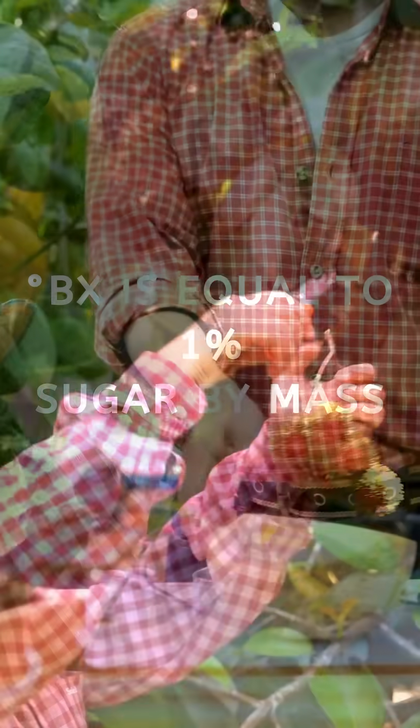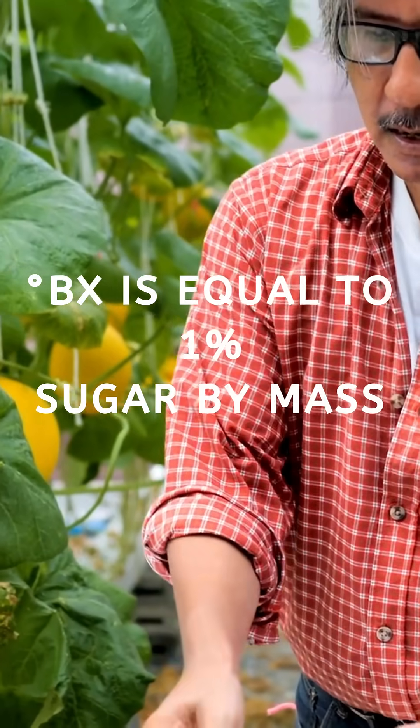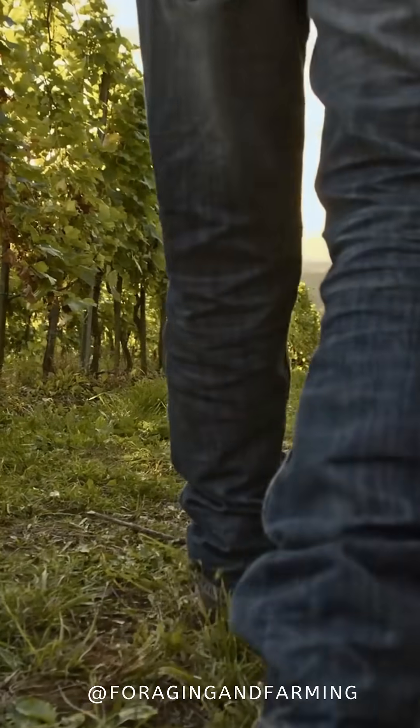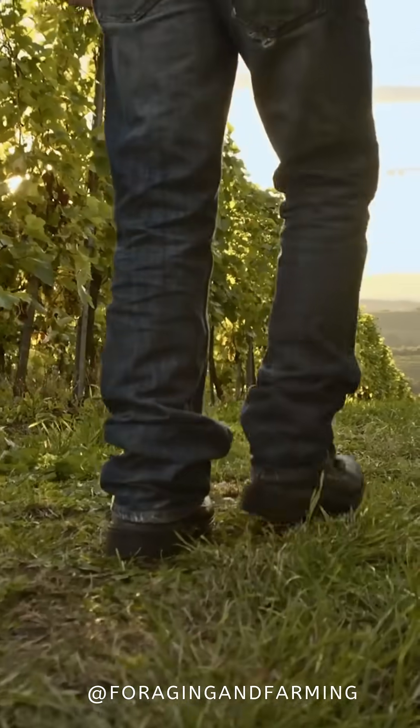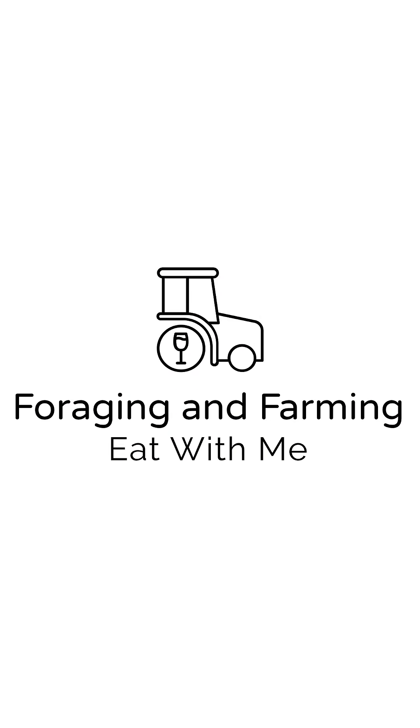BRICS is calculated as 1 degree equal to 1% of the sugar mass. So once the farmer sees a number reflected on the BRICS scale — for example 20 — they know their harvest contains 20% sugar, or is commercially ripened.